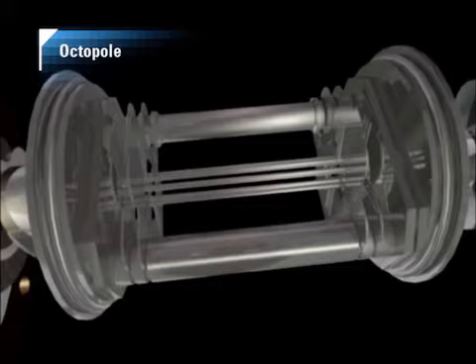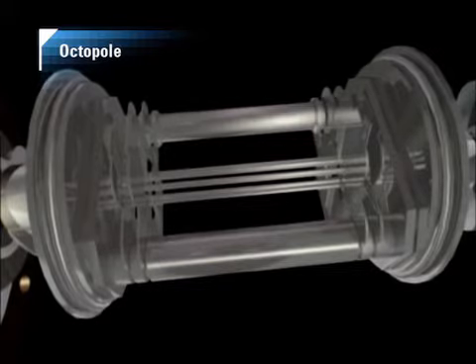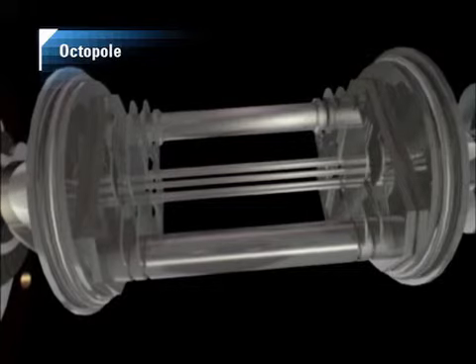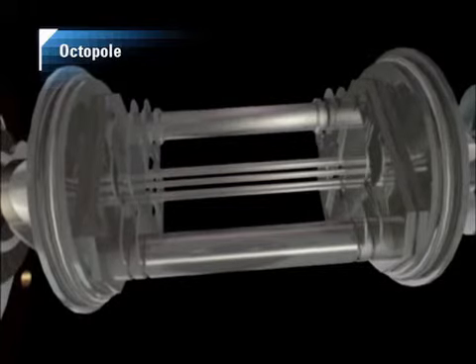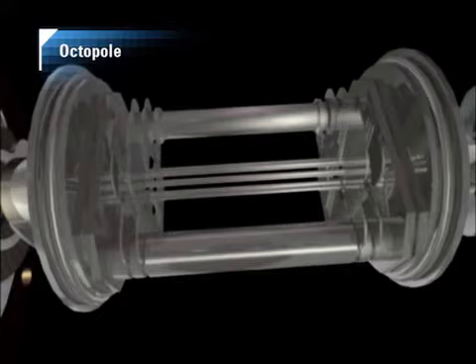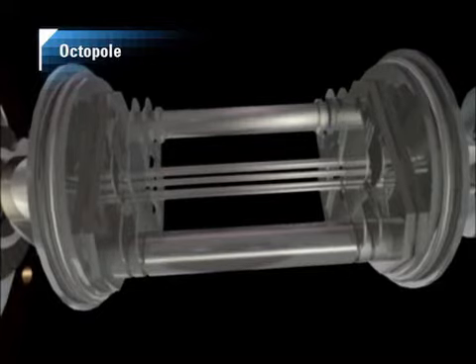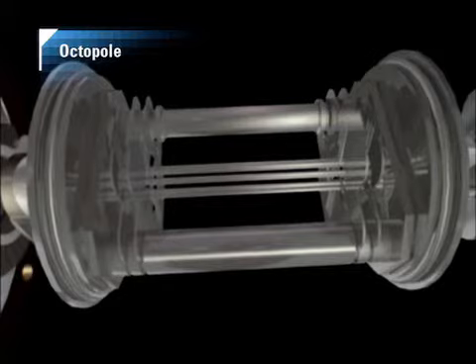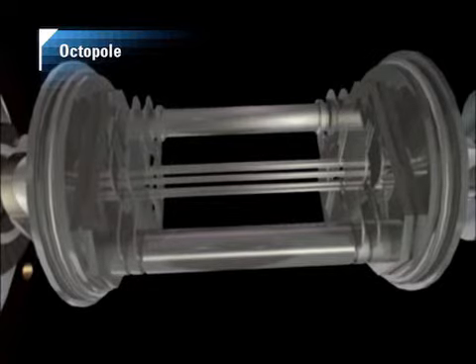Octopoles are small, reducing the size of the cell and allowing operation at higher pressure relative to other systems. This results in more ion-gas collisions and greater interference removal efficiency, which also enables the ORS to operate in collision mode using pure helium collision gas.